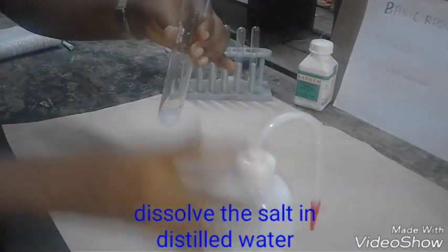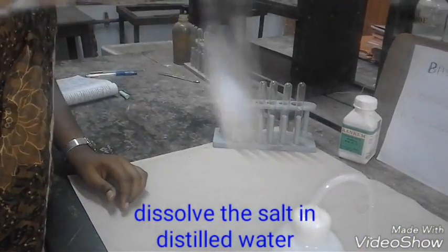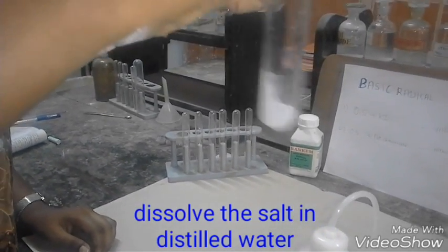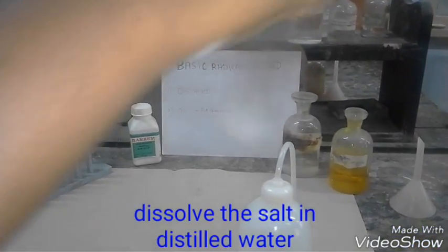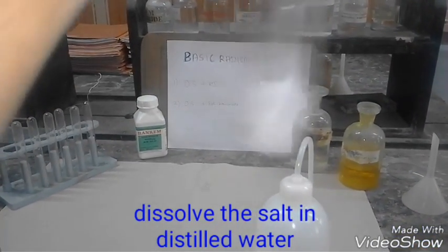Pour a little amount of water into the boiling tube. The solution must be below half of the boiling tube. Dissolve the salt completely in distilled water till the solution is homogenous.